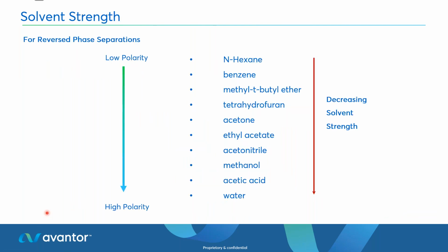When we look at the solvent strength, you can see they also have a different strength. So for example, if I want to run the same method with acetonitrile and switch it to methanol, I have to use a different percentage. You'd think that was a nice switch, we just do 10% more, but it doesn't quite work out that way because of those differing interactions.